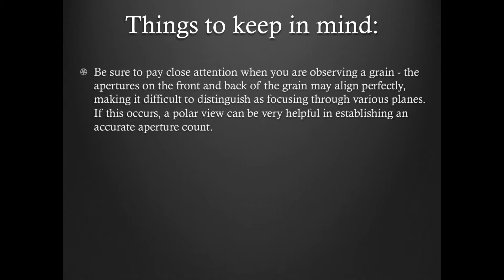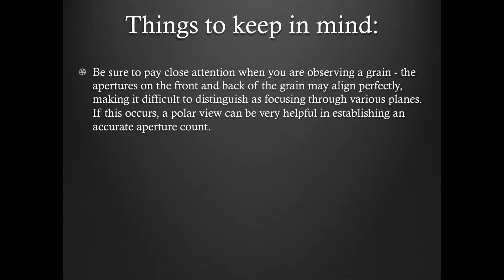Here are a few things to keep in mind. Be sure to pay close attention when you are observing a grain. The apertures on the front and back of the grain may align perfectly, making it difficult to distinguish as focusing through the various planes. If this occurs, a polar view can be very helpful in establishing an accurate aperture count.